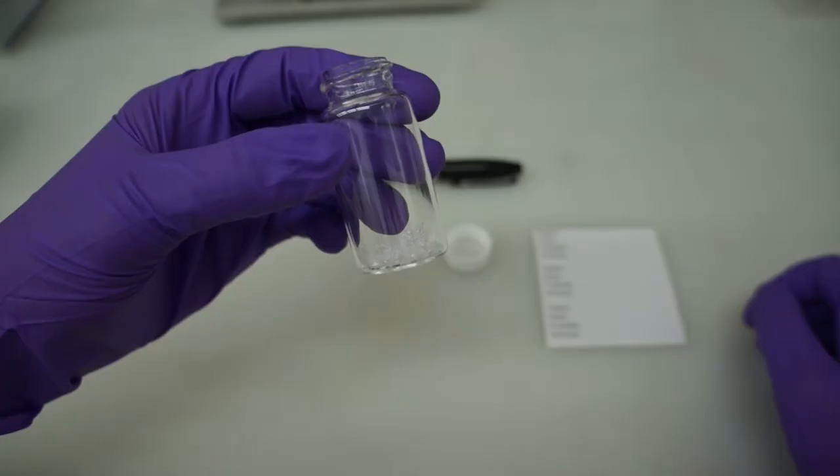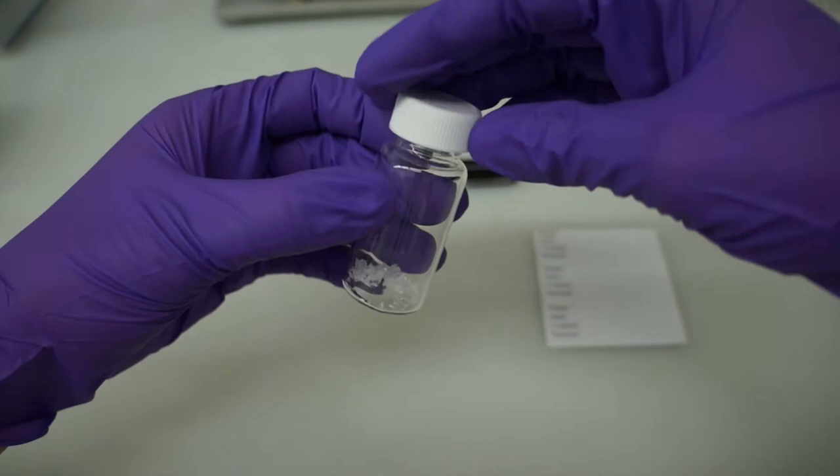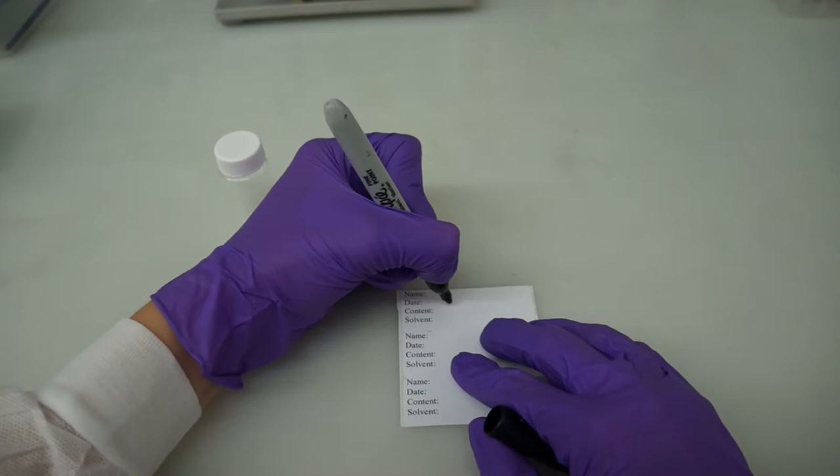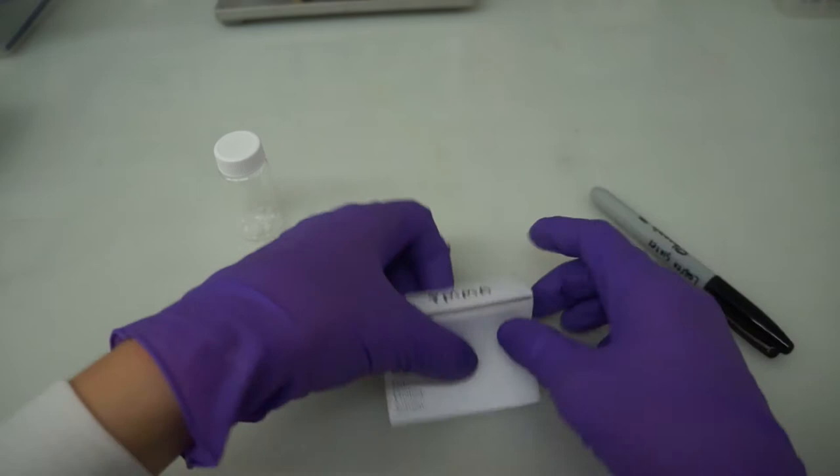Then carefully transfer the pieces from the mortar to your scintillation vial. Close the vial and label it. It's always important to label any sample that you create. Here I'm only identifying the contents of the vial, but you'll see in other samples that I also write my name and the date.